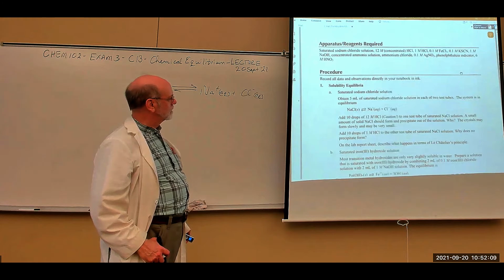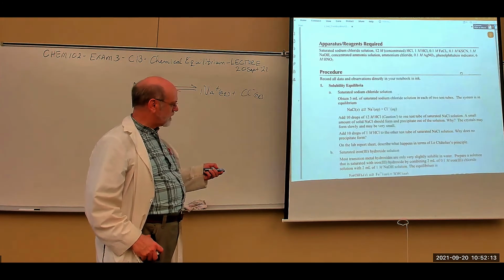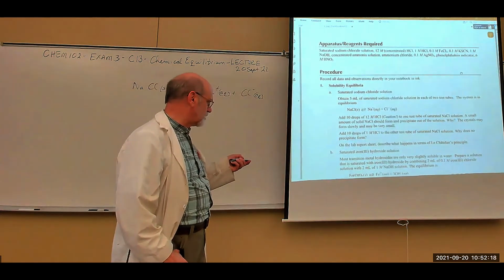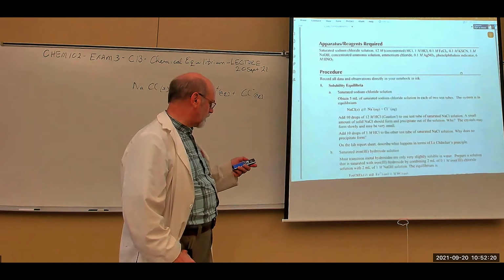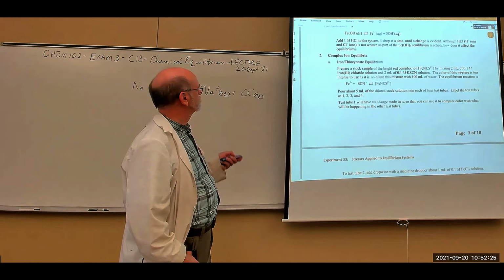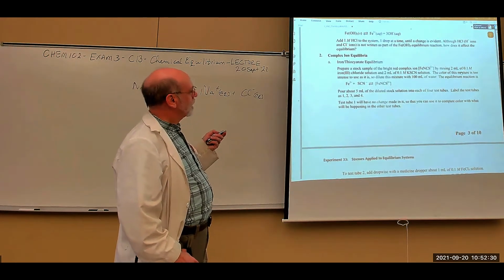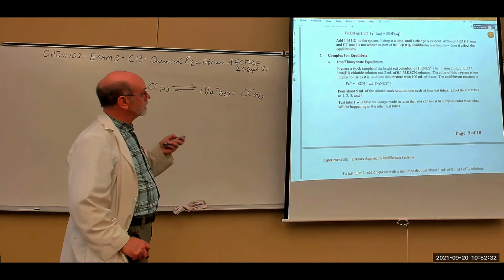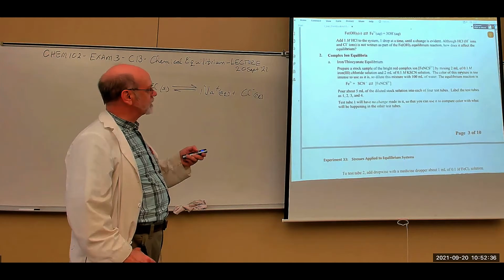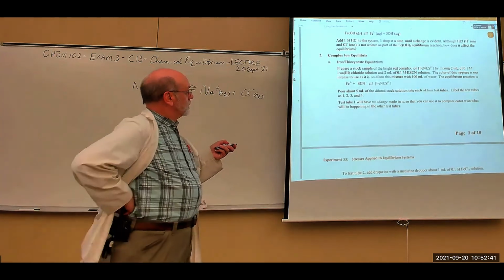let's go down. See, there's our solubility. Here's our iron. Actually, iron 3 hydroxide is the way we're getting iron 3 there. Okay, it's another solubility problem. Iron hydroxide is insoluble, so you're going to see that drop out of solution when you add iron and hydroxide together.